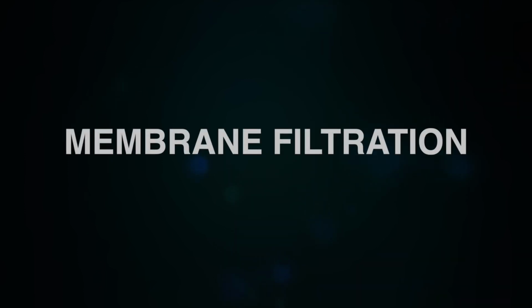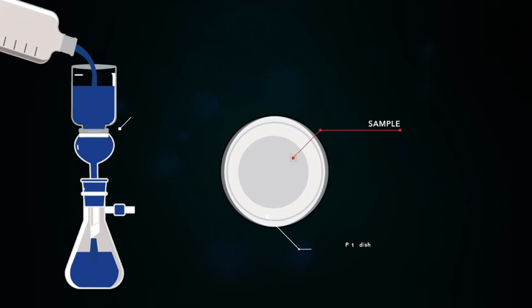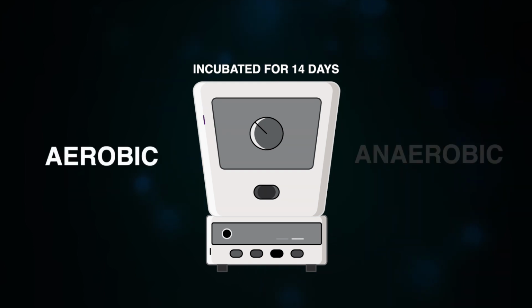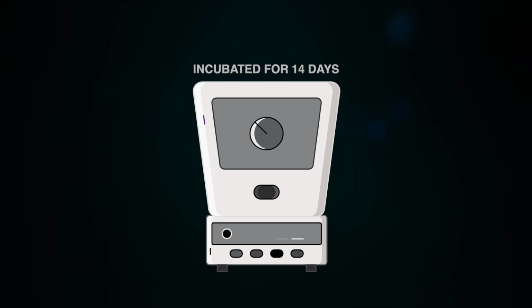Membrane filtration is another sterility testing type that assesses the contamination in medical products. Membrane filtration uses a membrane filter unit to retain microorganisms present in the sample article. Then the membranes are incubated in two types of media in order to detect aerobic and anaerobic microorganisms. Both methods require a 14-day incubation period.